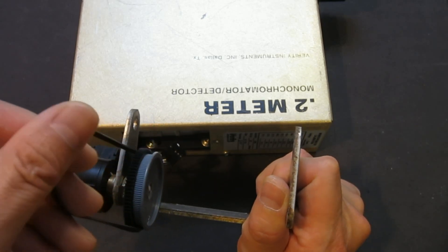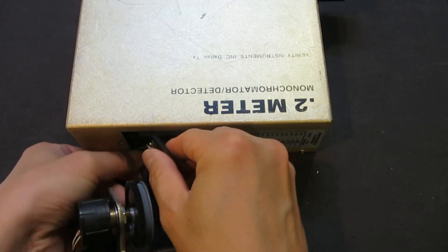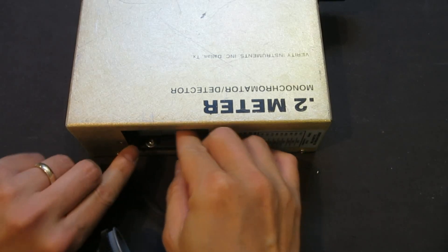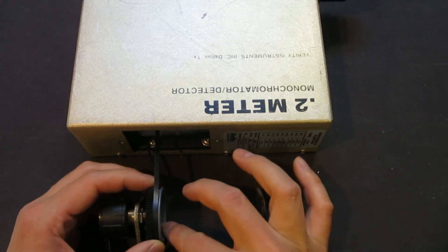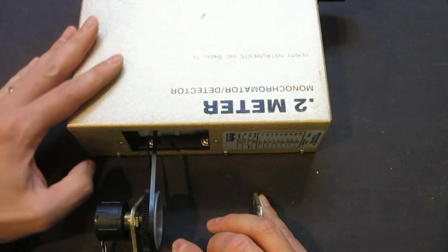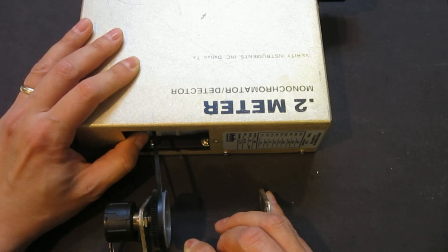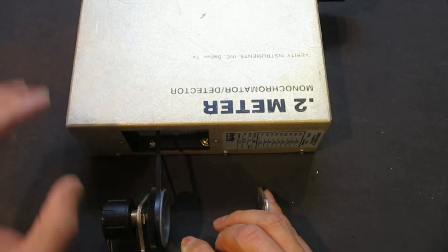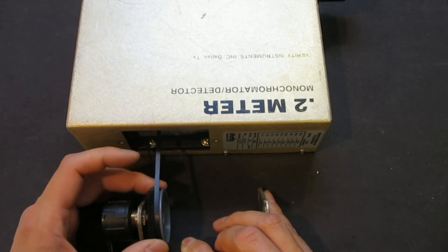The idea is that I wanted to put this over the dial here. When I manually change the wavelength, this optical encoder will move along.